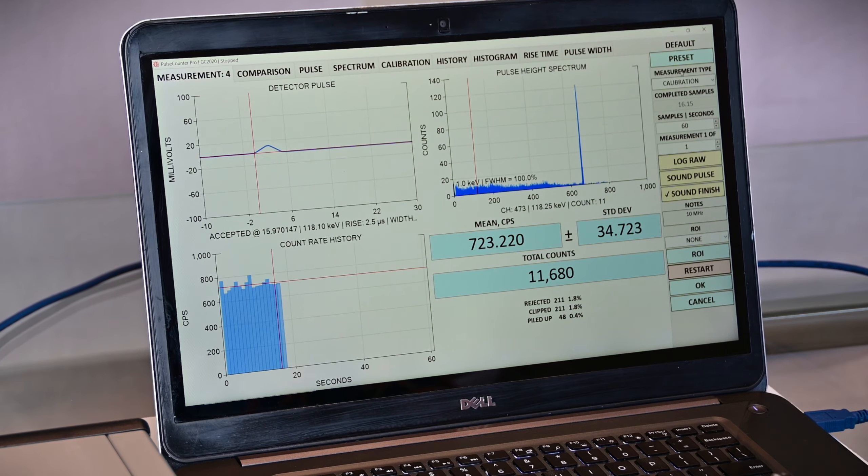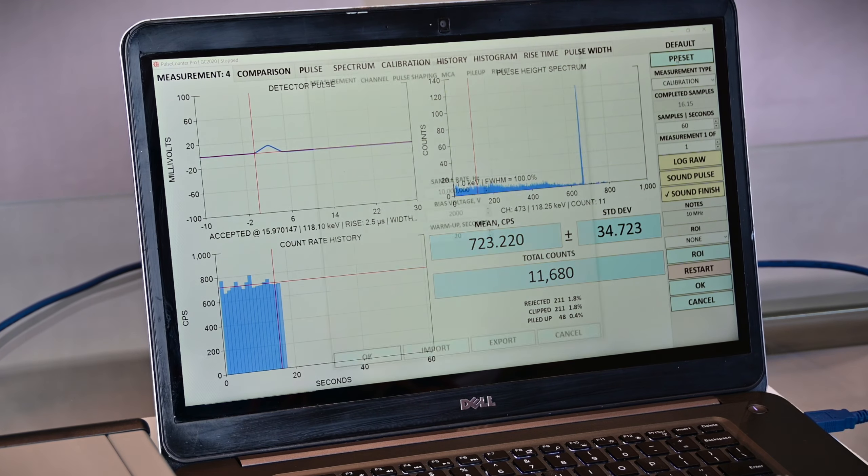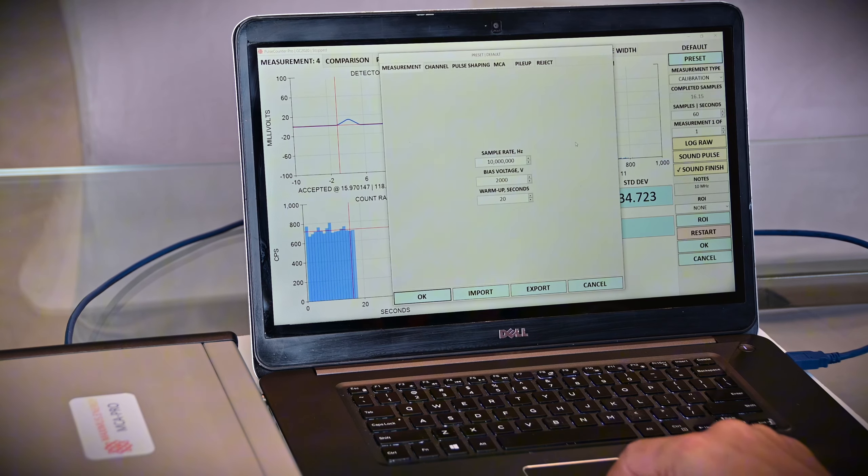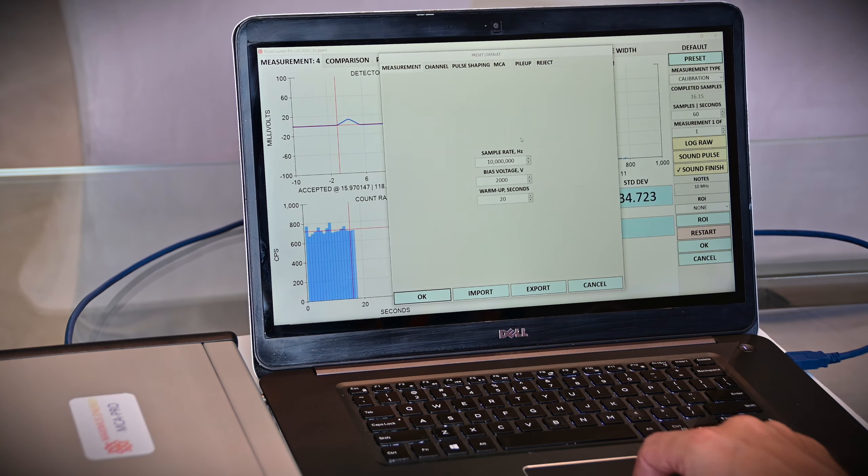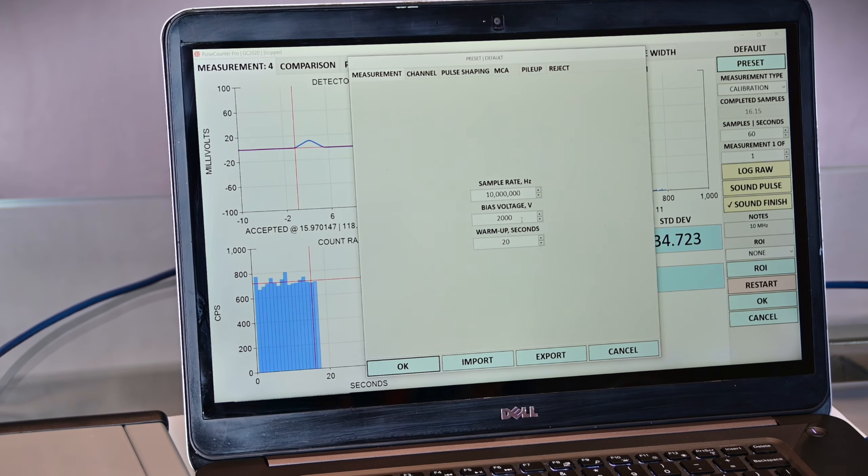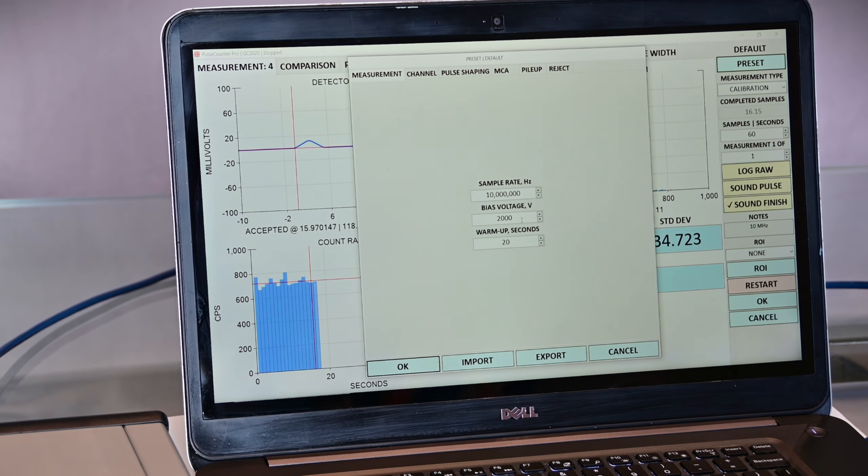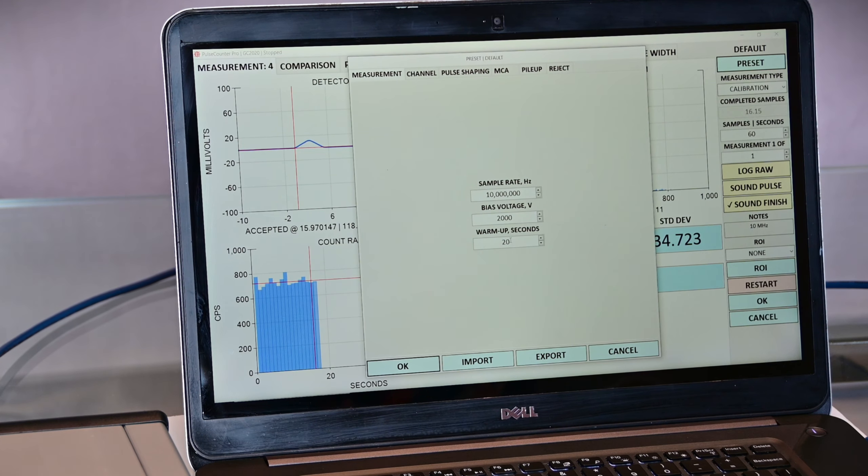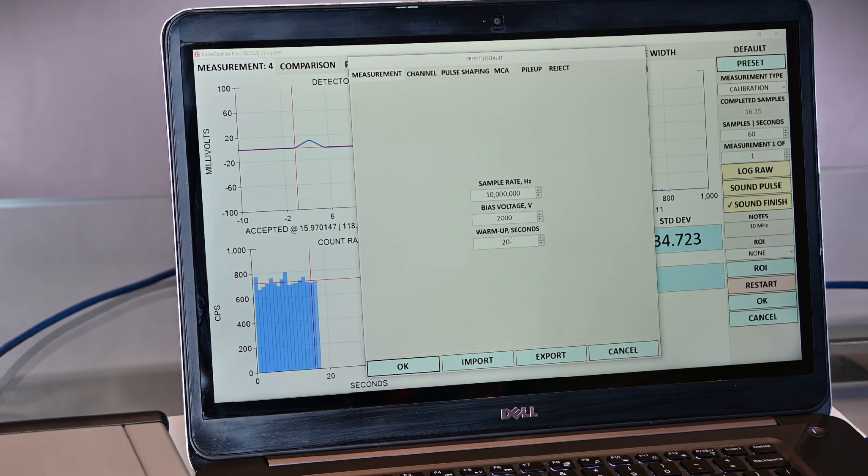A quick note on the preset setup. I recommend sampling rate of 10 MHz. In this case, my detector bias voltage is 2000 volts, and I set up for a ramp time of 20 seconds to allow for gradual voltage build up on your detector.